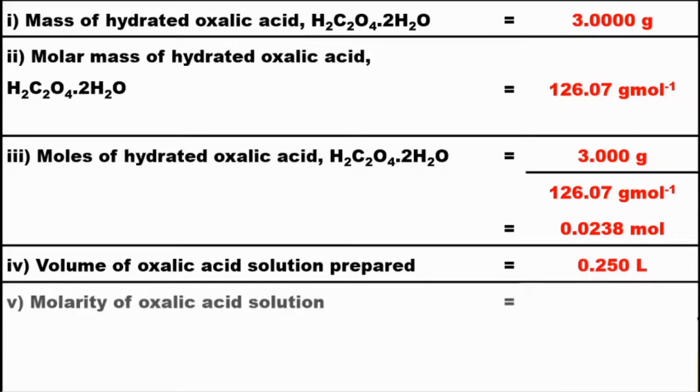Finally, we are going to determine the molarity, or the concentration, of the oxalic acid solution that we have prepared. Molarity equals moles of solute, in this case moles of hydrated oxalic acid, divided by volume of oxalic acid solution prepared in liters.